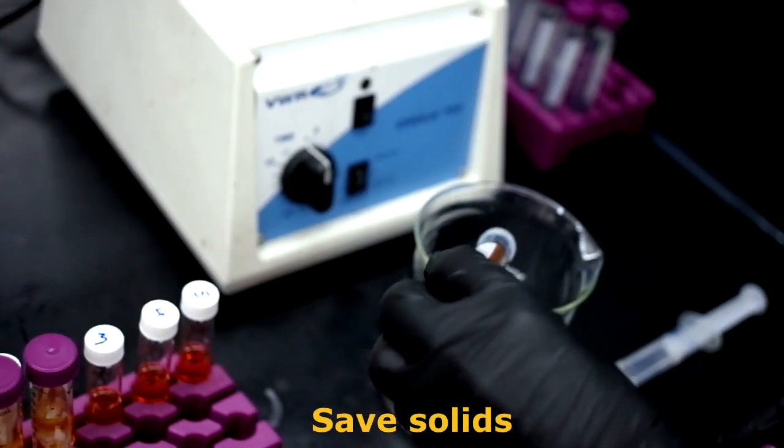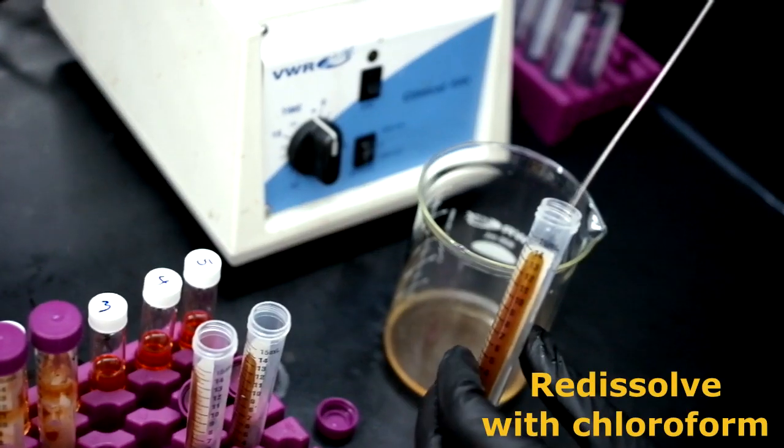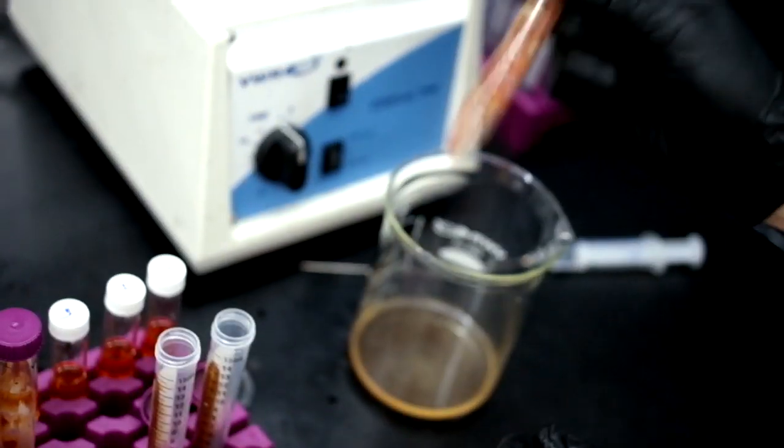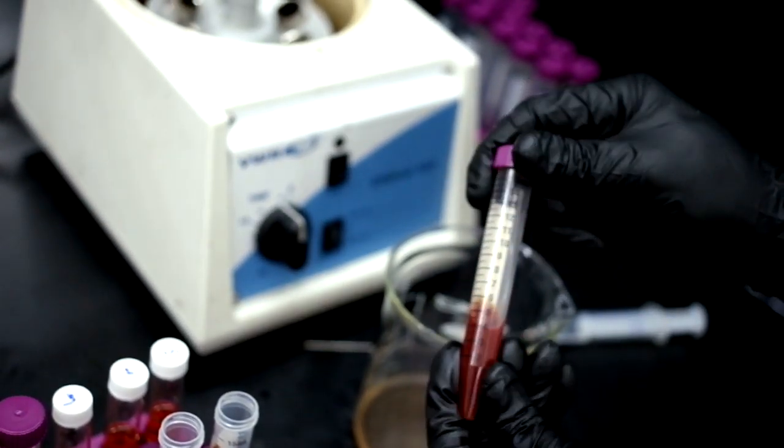Pour off the liquid and save the solids. Add fresh chloroform into each test tube to re-dissolve the crystals. Shake to ensure that all the precipitate has properly dissolved.